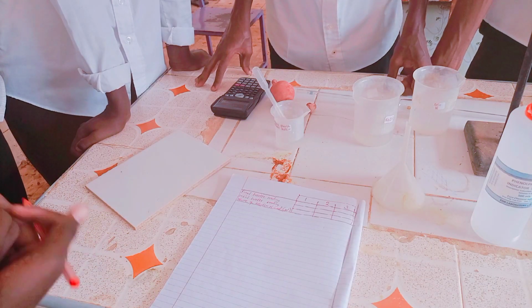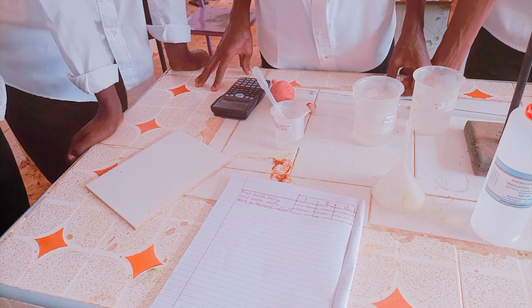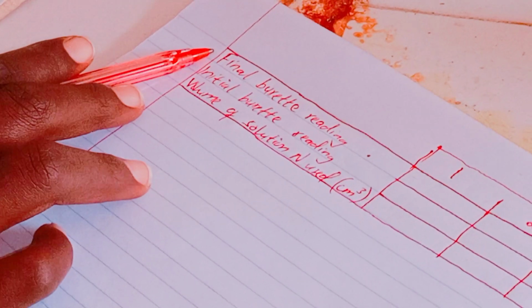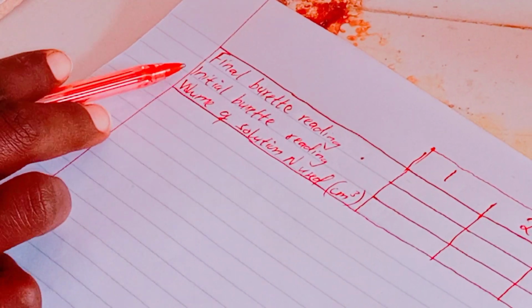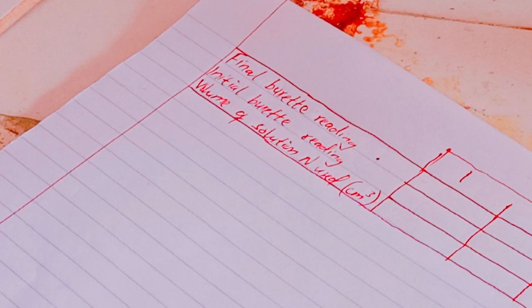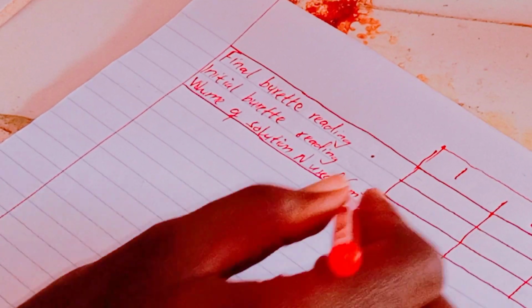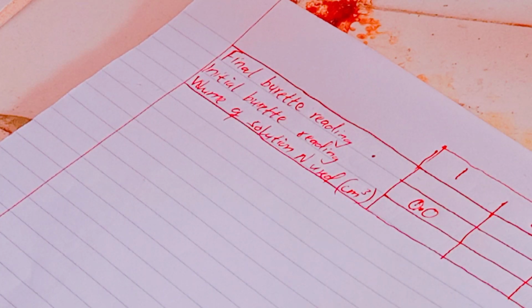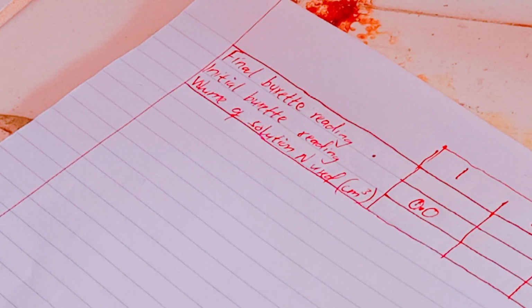So now I want us to fill that titration table. As you can see, there is a burette reading there. We have the initial burette reading, and finally the volume of solution N used. The initial burette reading for the first experiment was 0.0. Remember, when you are filling the table, you must use 1 decimal place throughout, so it is 0.0. Now after doing the titration, the final burette reading was 9.1.